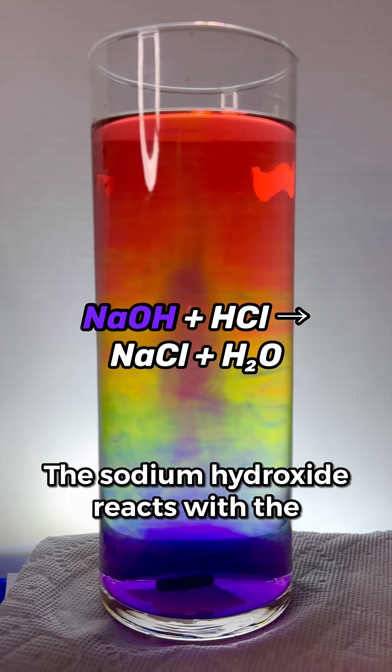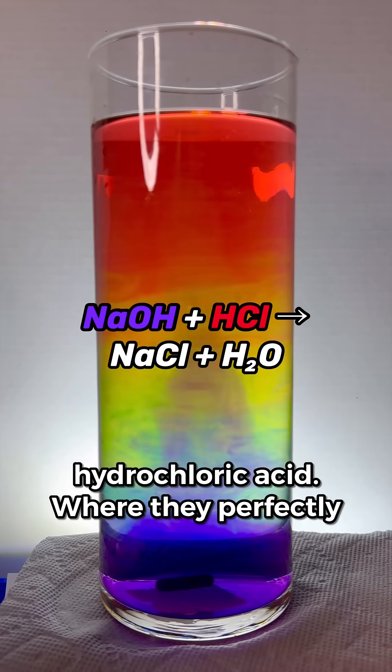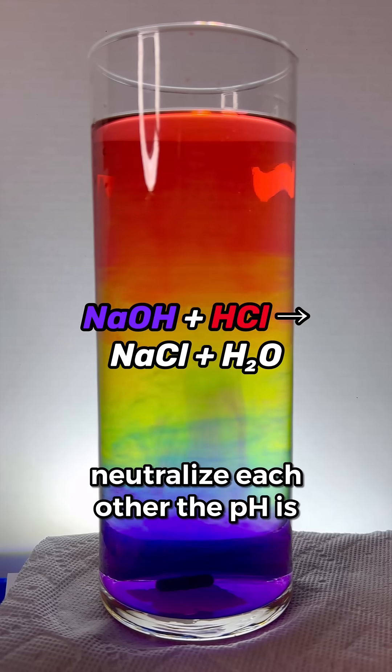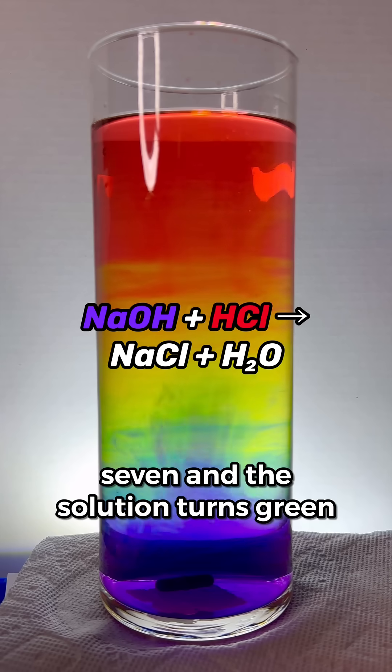The sodium hydroxide reacts with the hydrochloric acid. Where they perfectly neutralize each other, the pH is 7, and the solution turns green.